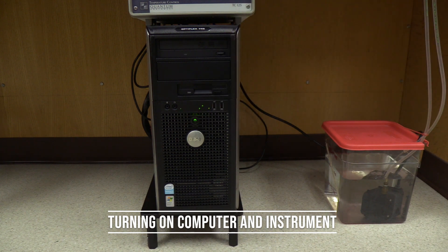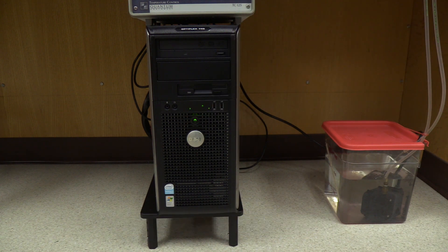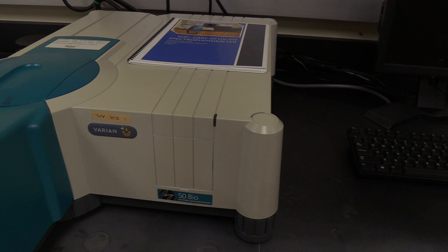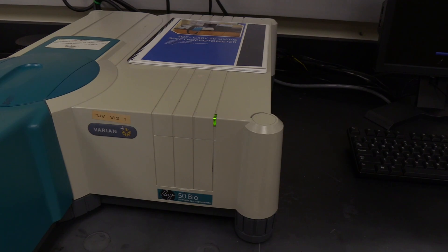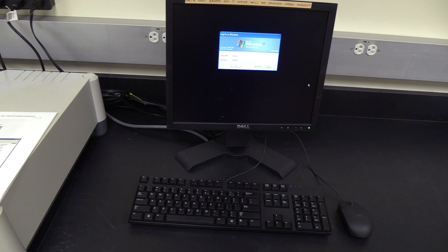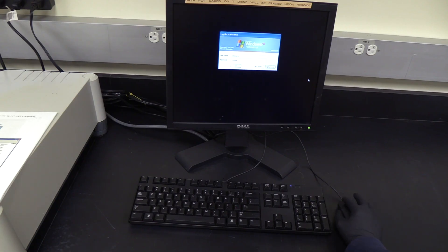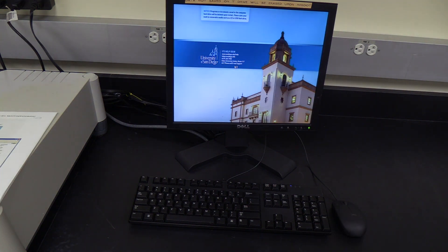Press the power button in the center of the computer tower. The instrument power light should turn on. For the best performance, allow the instrument to warm up for at least one hour. Next, log in to the instrument computer. The username and password are found in the instrument SOP.